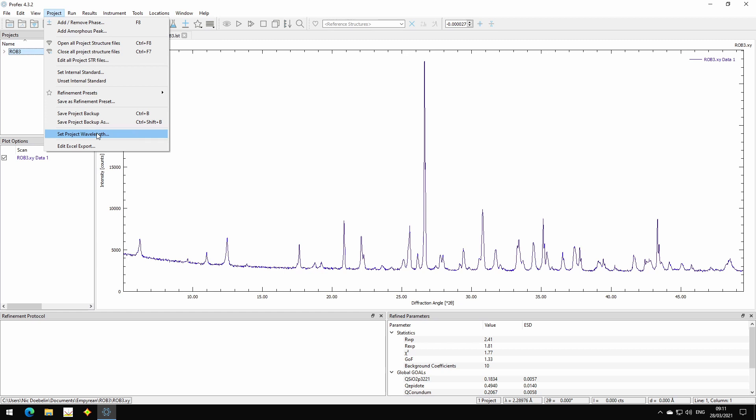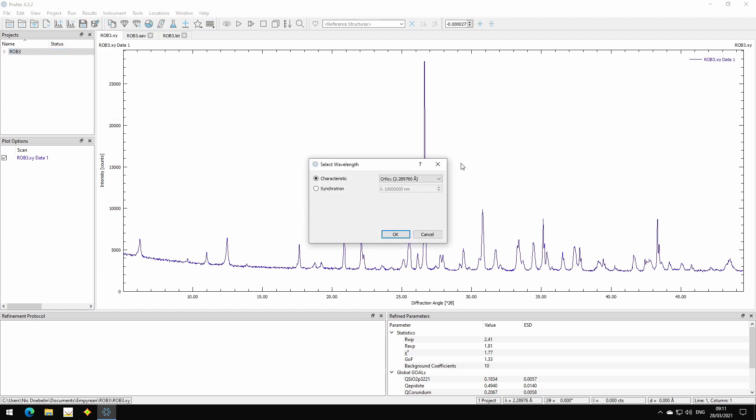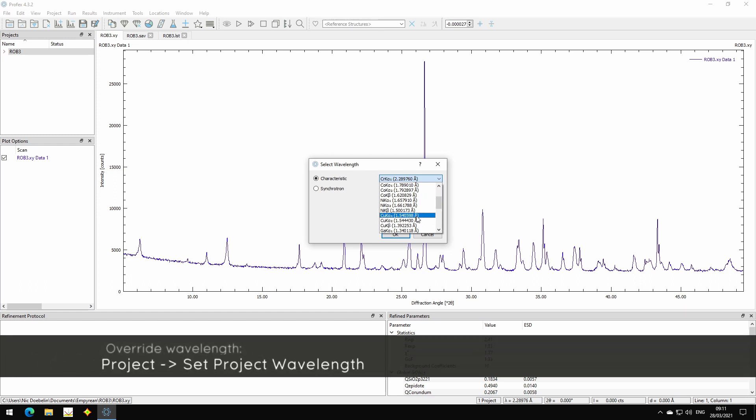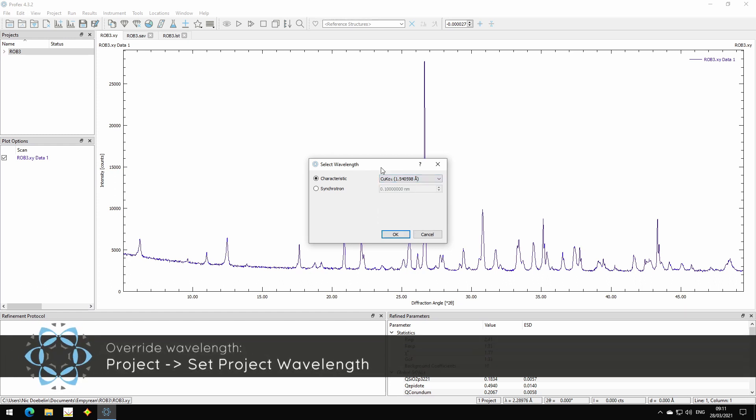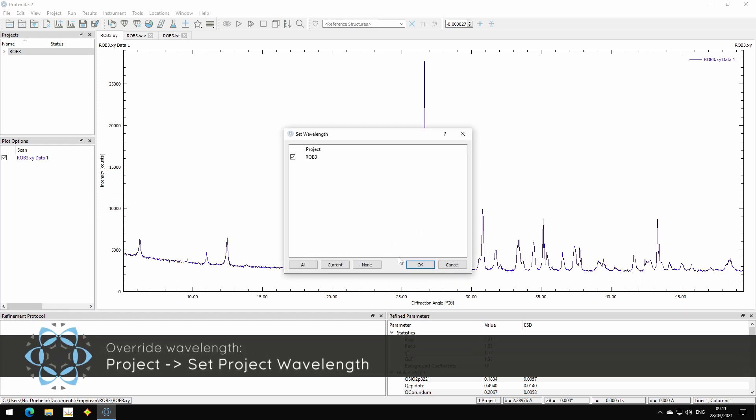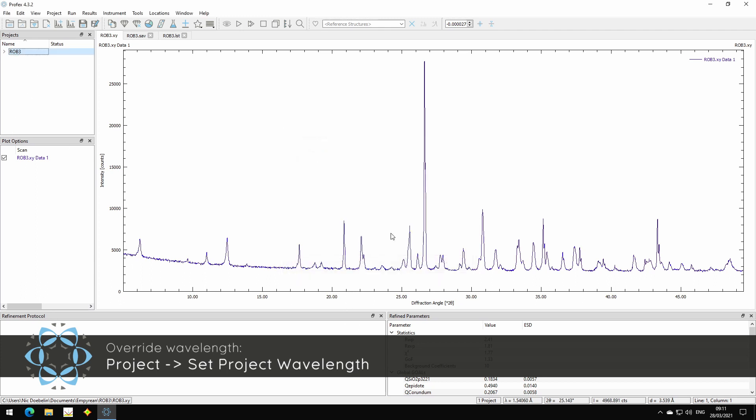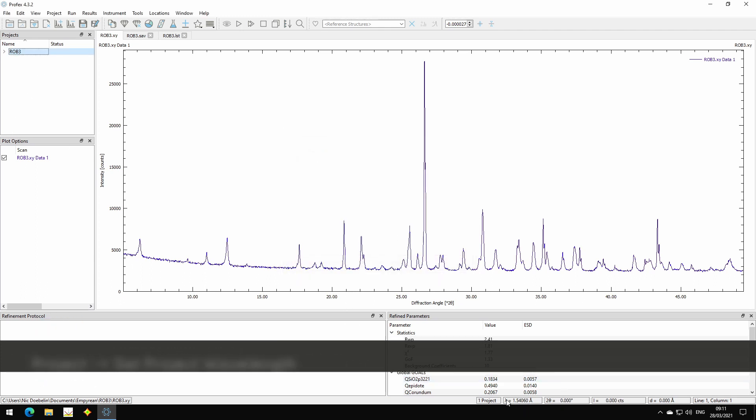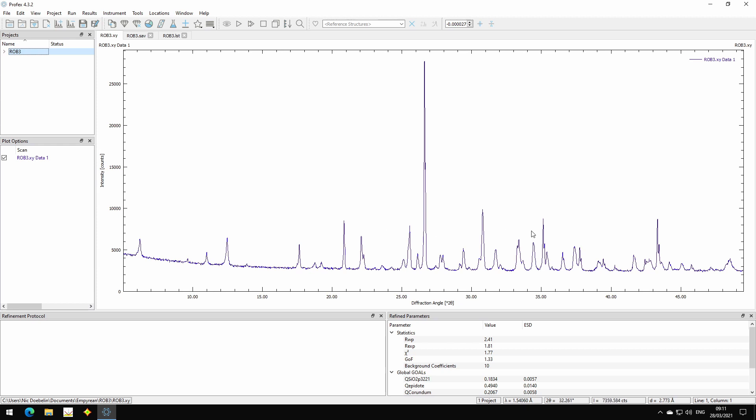Now we select copper k-alpha-1, apply. We can apply it to multiple projects. And now it's using the correct wavelength and also the correct conversion to D values.